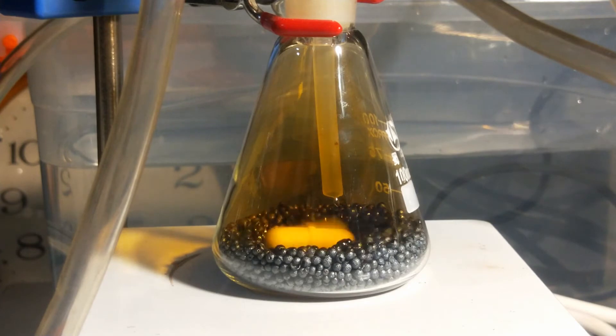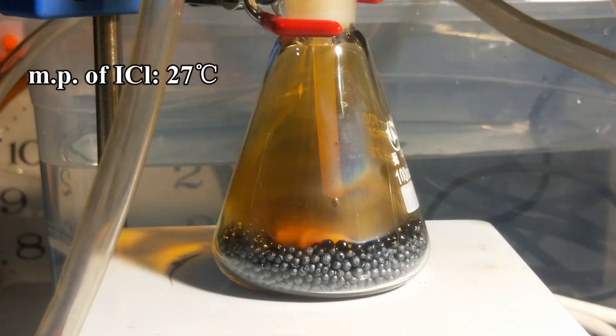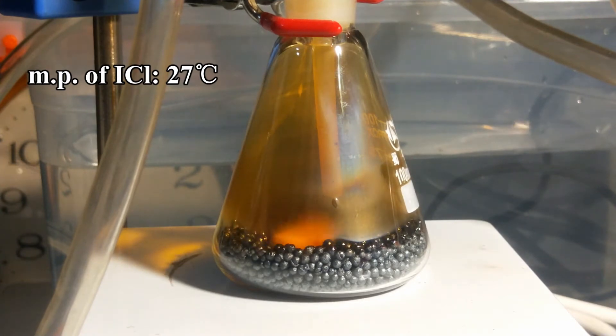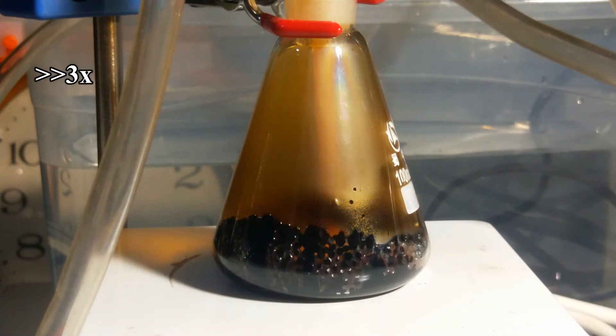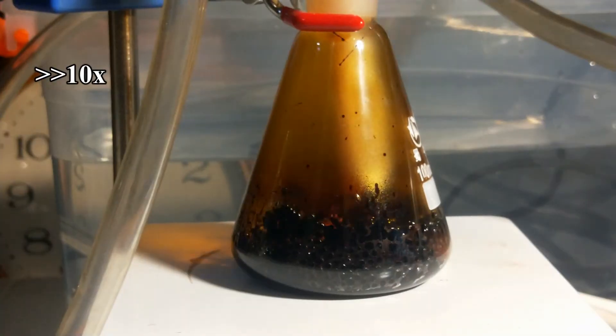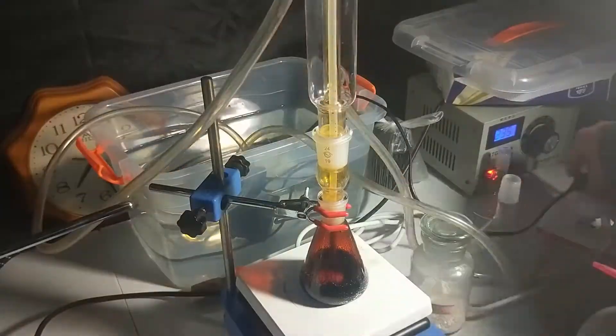According to the internet, the melting point of pure iodine monochloride is 27 degrees Celsius, but the mixture of iodine and iodine chloride has a lower melting point, even below 10 degrees Celsius, so that the reaction is not complete even after the mixture was fully liquefied.